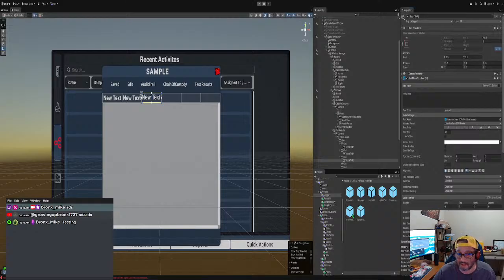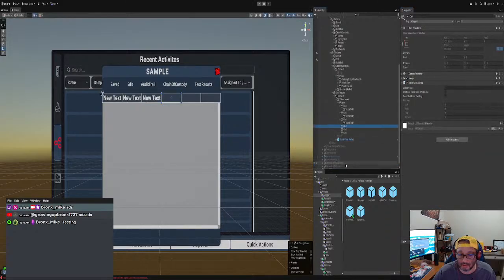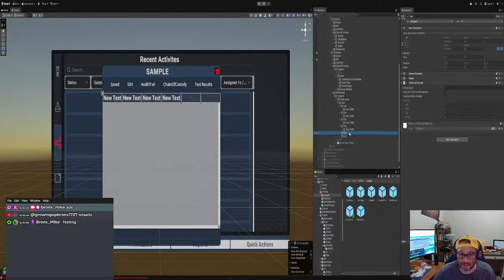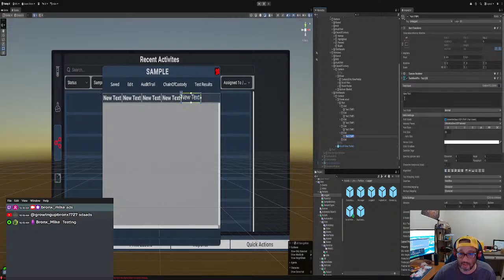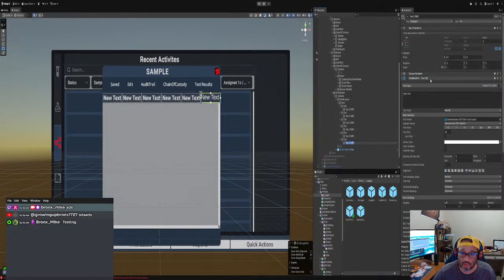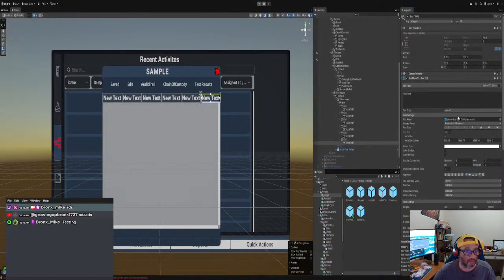And you can save the values like that as well. Okay, and so we got here UI text, right? I do it this way. It's just easier for me because I get confused, and that's how I do it. All right. Okay, so now we have here UI, boom, and then values, boom, right?